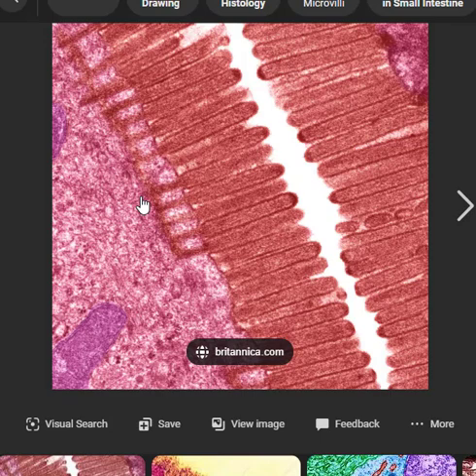So the way you can slow down the food that's moving through your intestines is to actually take proteins, stick them up through the cell membrane, and make these extensions. So these are microvilli, or little fingers sticking up there. And so now the food is going to be going around and through and around and through, and so you can absorb stuff. So they have an arrow saying number 3 is microvilli, but you actually can't see them.